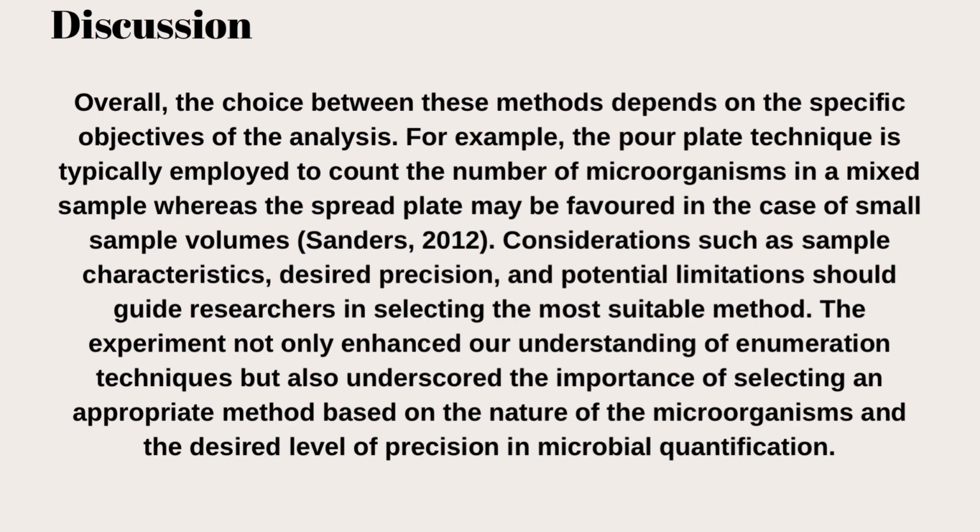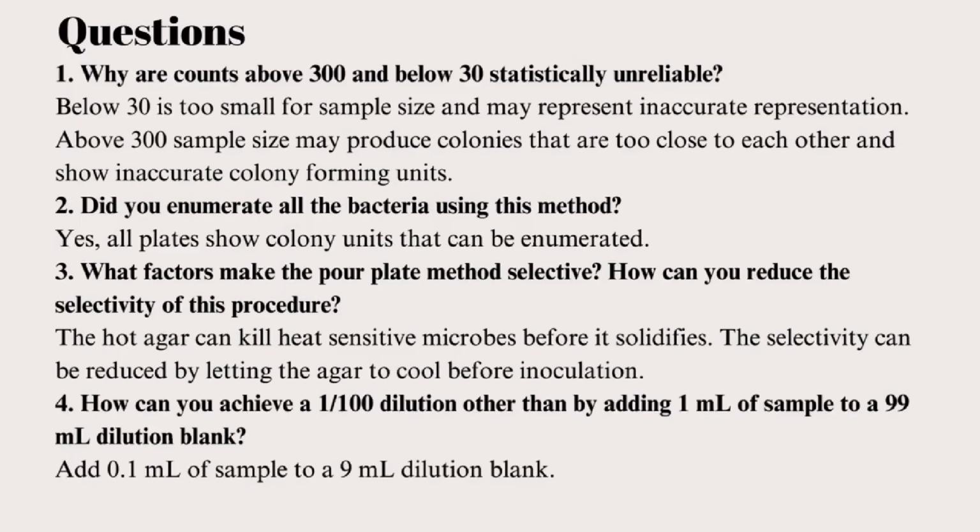The experiment not only enhanced our understanding of enumeration techniques, but also underscored the importance of selecting an appropriate method based on the nature of the microorganisms and the desired level of precision in microbial quantification. These are the answers to the questions asked. Please pause to read.